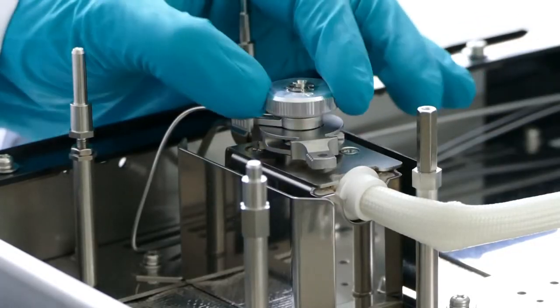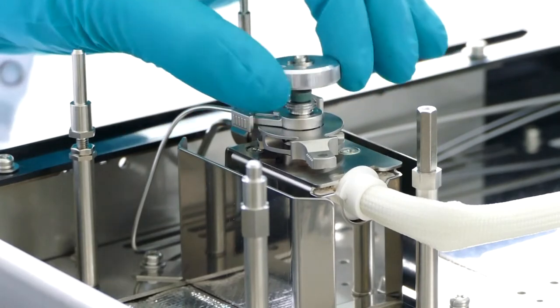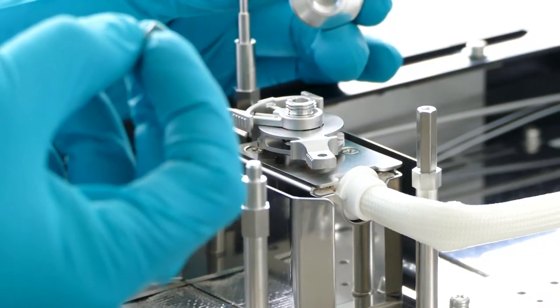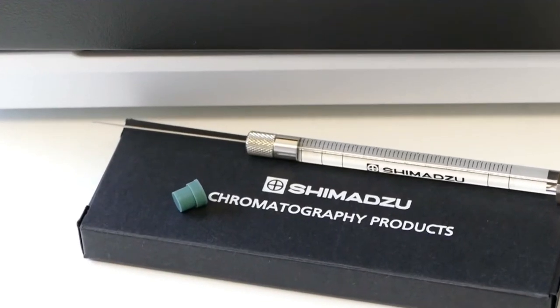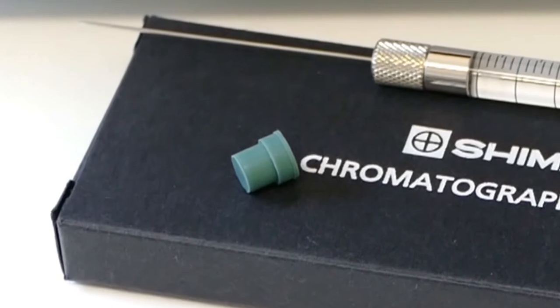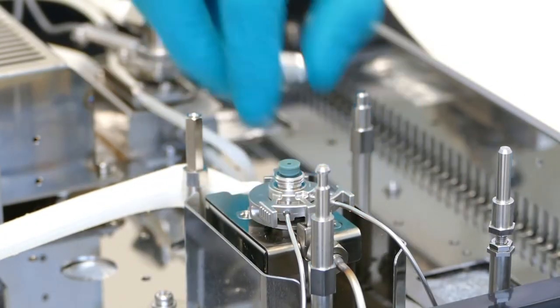To access the septum, loosen the retaining screw and remove the septum. Due to their special shape, Shimadzu's uniquely designed T-Septor creates a reliable seal. The septum is placed on the injector head and fixed with the septum screw.